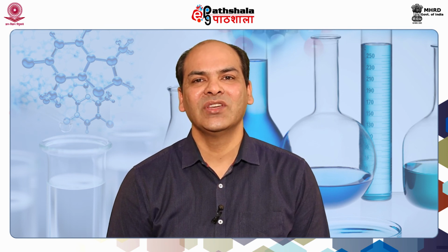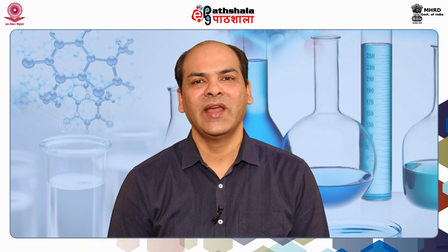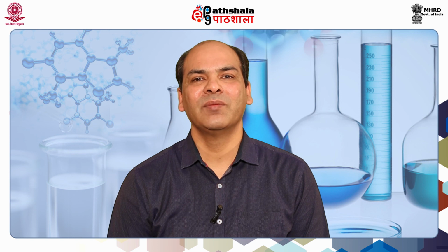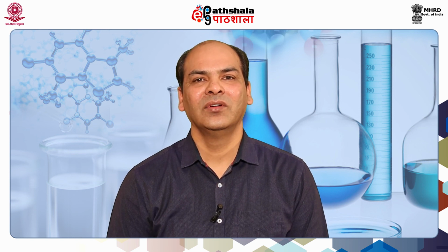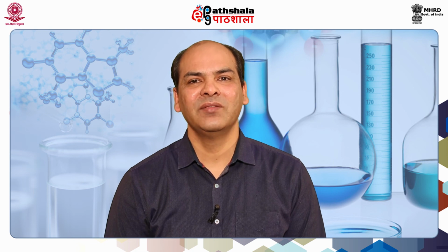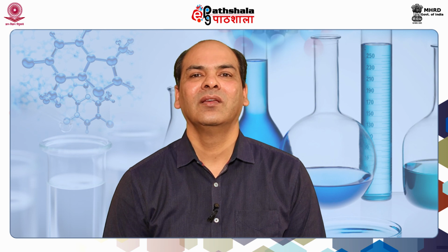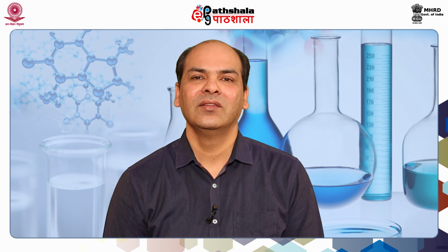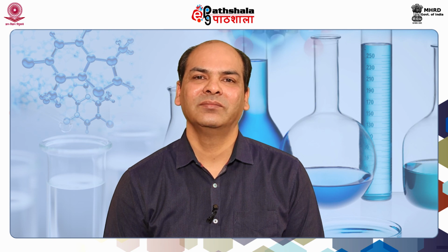In the next lecture, I'll be talking about the use of circular dichroism and ORD for determining the structure and conformation of biomolecules like DNA, protein-protein interaction, protein-DNA interaction, and different types of DNA. That we will see in the next chapter.